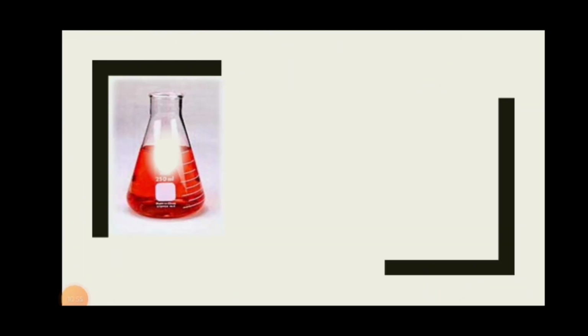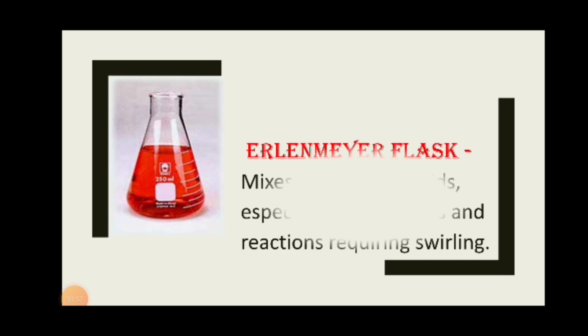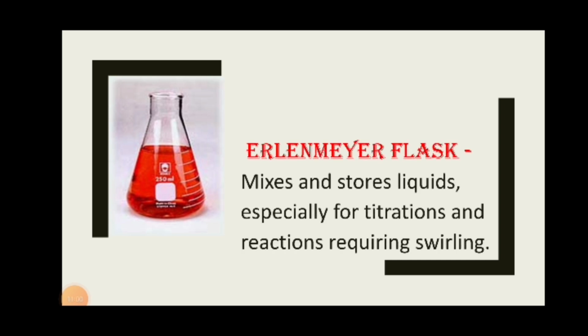So, yes, Erlenmeyer flask mixes and stores liquids, especially for titrations and reactions requiring swirling. So actually, the Erlenmeyer flask is not a device used to measure an amount of volume of liquid. It's only for storage and for titration reactions.